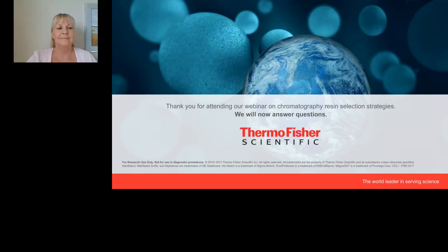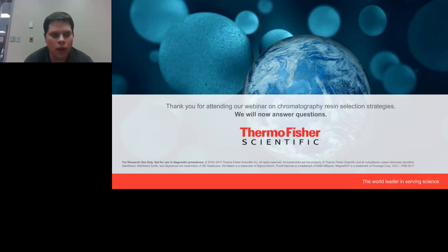Thank you so much for that answer. And we'll wrap up with one more question for Scott. You had a slide showing magnetic agarose had higher yields compared to non-magnetic agarose for nickel NTA and glutathione small-scale purifications. Can you elaborate on why the magnetic agarose beads have better recovery?